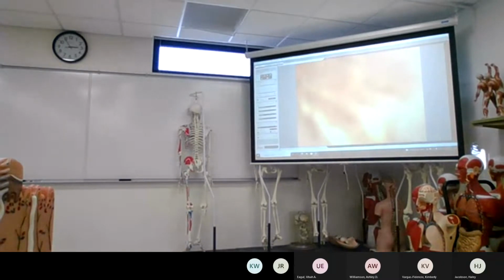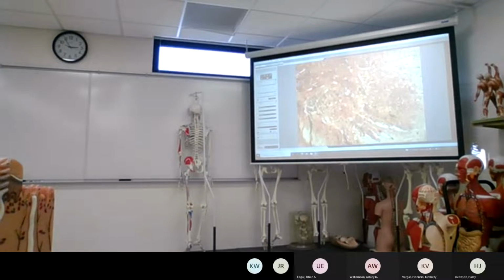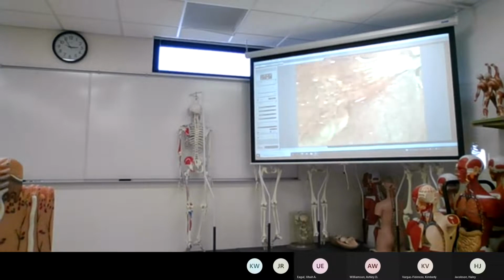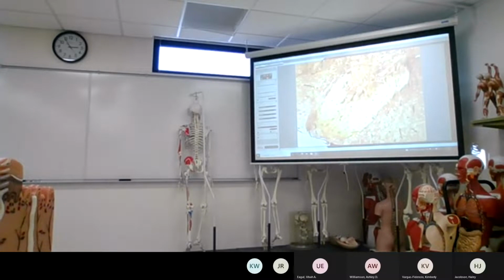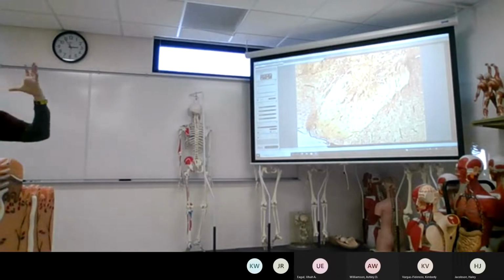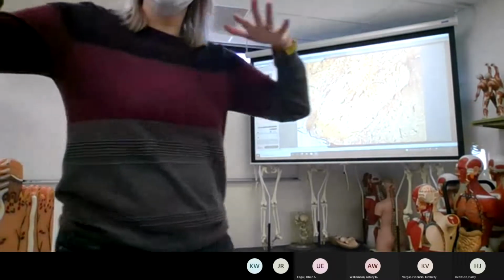All right, so our last tissue after our muscle tissue is our nervous tissue. And so far, we've been focusing on the neuron. It looks a certain way. It's a big kind of one-eyed monster, and then it has one long projection.